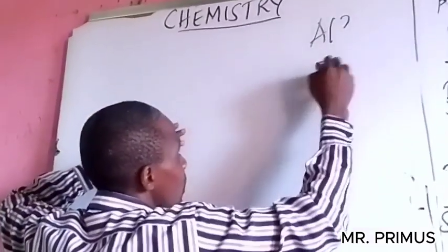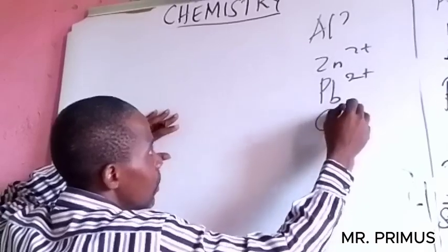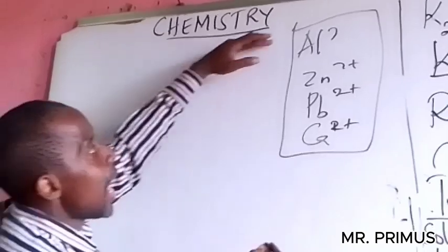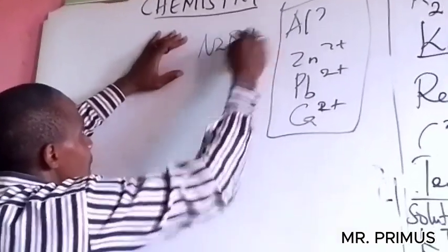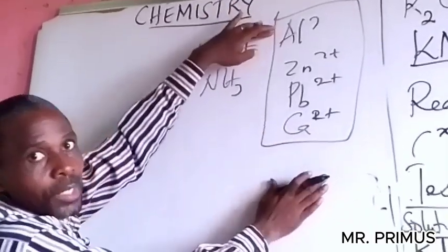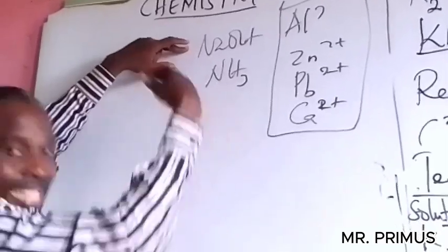Assignment: use of sodium hydroxide and use of ammonia solution in precipitating metals. Metals: aluminum, zinc, lead-2, calcium. In precipitating these metals, how do sodium hydroxide, aqueous ammonia and the rest of them act on these? Which one will form precipitate? Which one in drops and in excess?